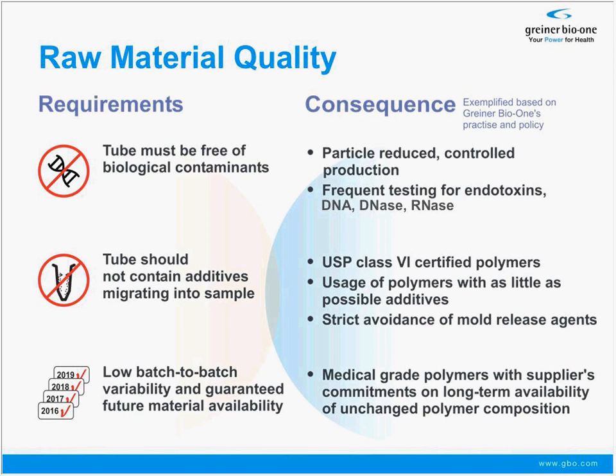This label is the label medical grade polymer. It's used by polymer manufacturers, and it suggests and also provides evidence that the raw material has a long history, that cleaning procedures and other measures are taken, so that there is little chance that the raw material with the given composition can be mixed up with other batches of raw material, maybe even other subtypes of raw material.